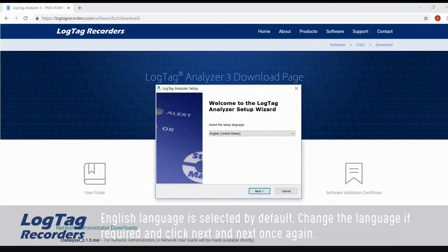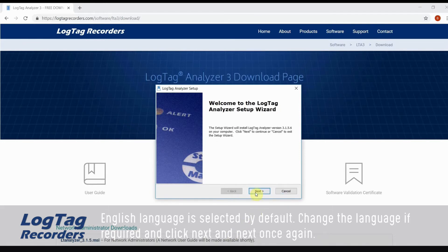English language is selected by default. Change the language if required and click next and next once again.